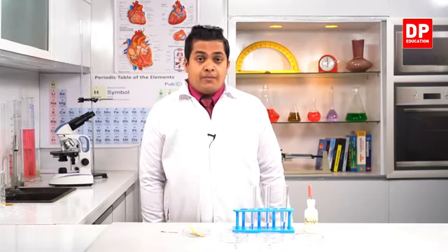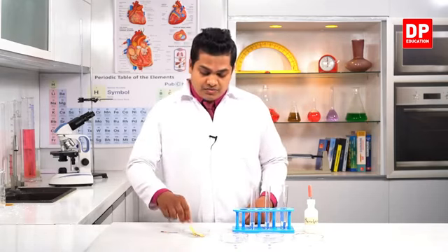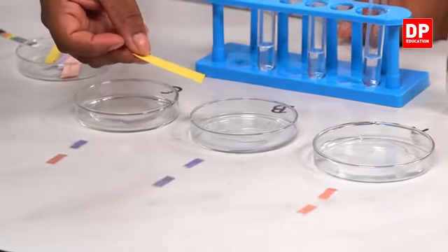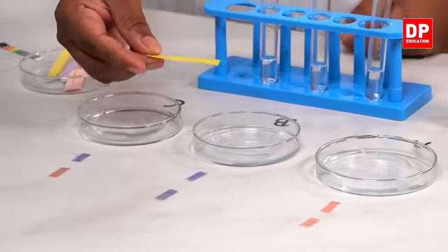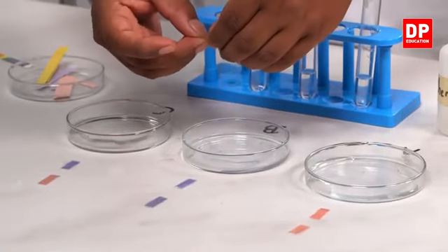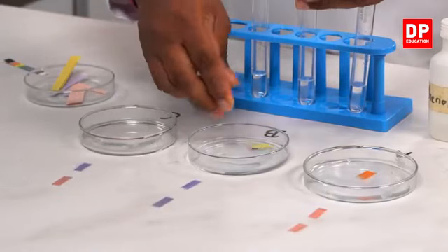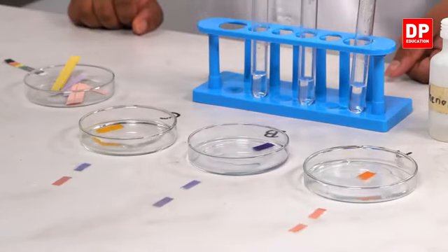Okay, now the third and final paper, pH papers. So now I am going to add a piece of pH paper to each of these containers. pH papers, a kind of yellow color paper strip. So we'll add pH papers, one to the acid, one to the base, and one to the neutral substance.